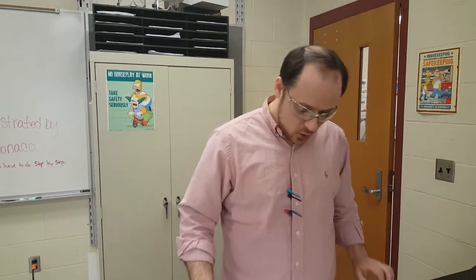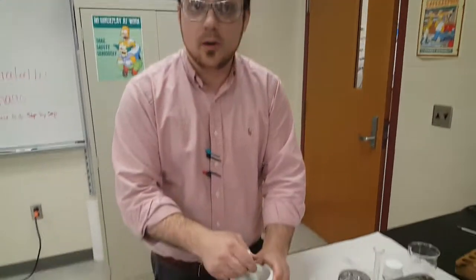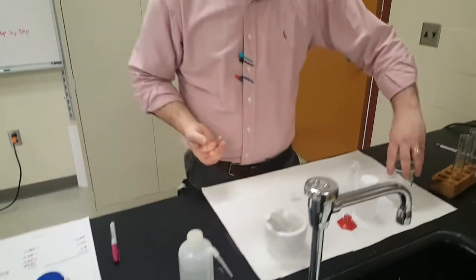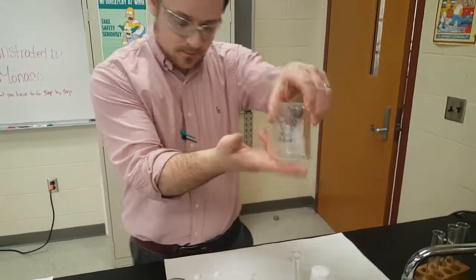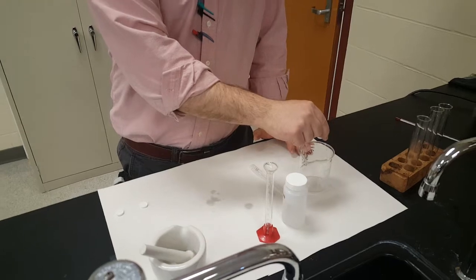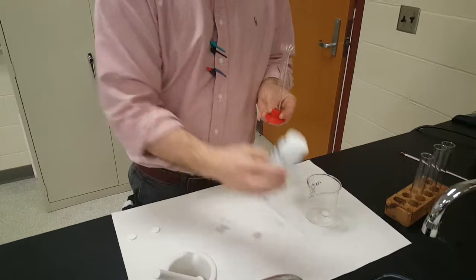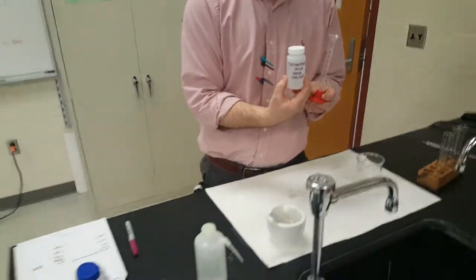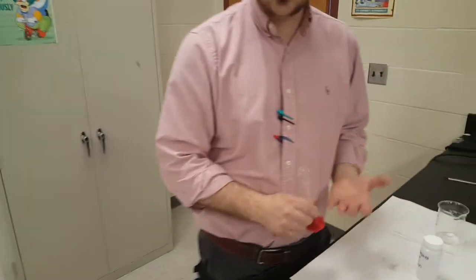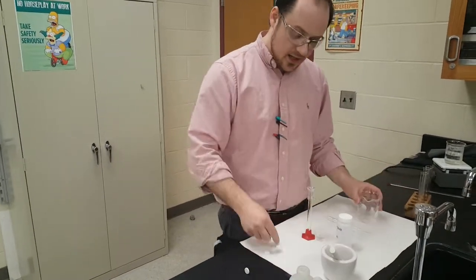So you're going to need 3 tablets again, but this time you're going to react a whole tablet, a tablet that you broke up by finger pieces, and then a tablet that you ground up in the mortar and pestle. The way you do that, get your particle size beaker, put it on the table. You can start by putting a whole tablet in, and then you measure 10 mils of the concentrated acid on top. Okay. Dump it in, see how long it takes to react.